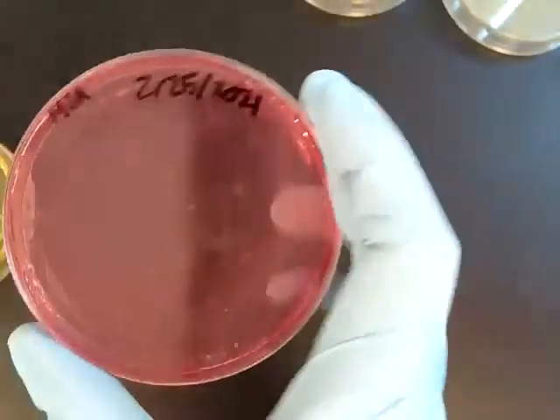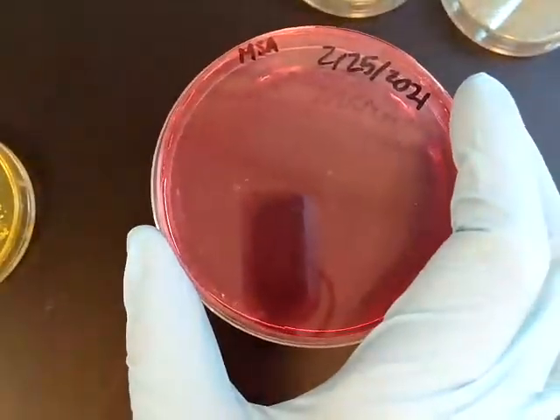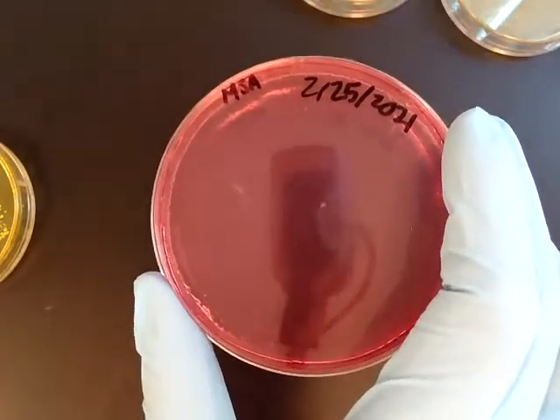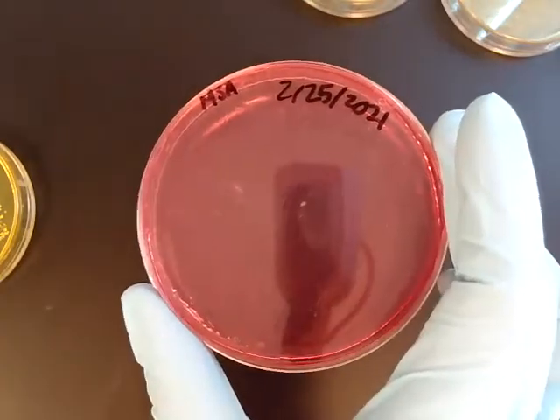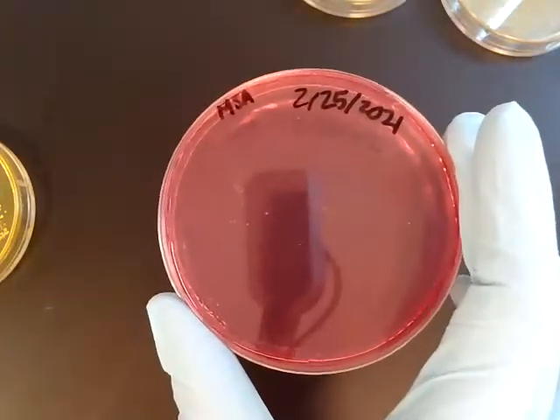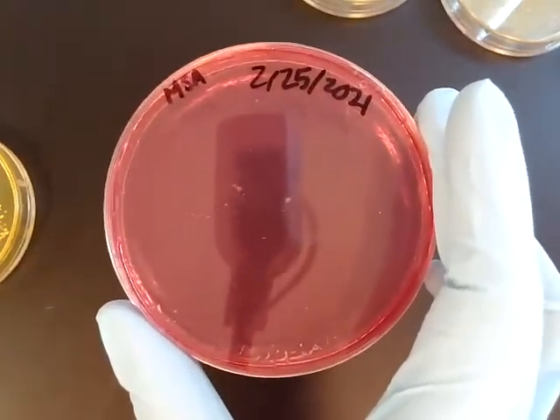This is E. coli on the plate. You can see that there is no growth on the plate, and because there's no growth, we can't mark this based on mannitol fermentation. This is just indicating that this is a negative result for growth. E. coli can't grow in the presence of this high salt concentration on the plate.